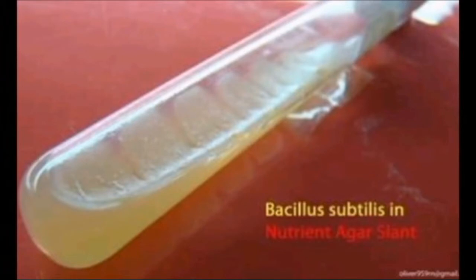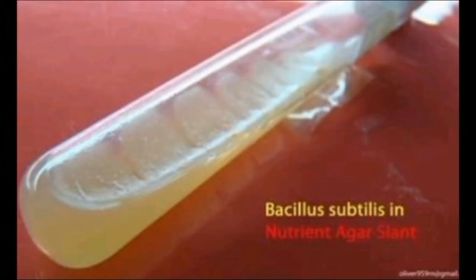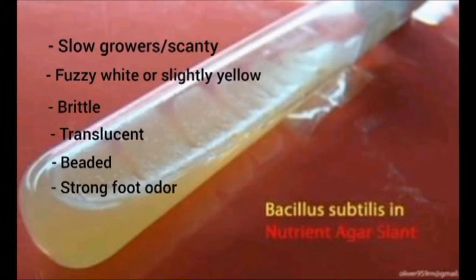The first example of bacteria is the Bacillus subtilis, found in soil and in gastrointestinal tract of ruminants and humans. Their amount of growth, they are slow growers, they are scanty. Their color of colony, fuzzy white or slightly yellow. Their texture or consistency, they're brittle or dry, friable. Their optical characteristics, they are translucent. And their form of growth, beaded. Their odor is like a strong foot odor.